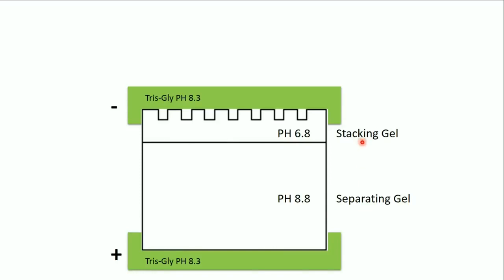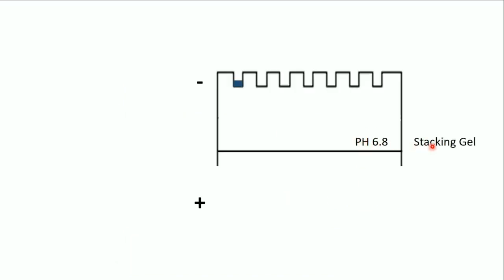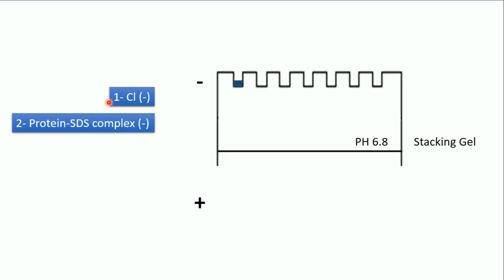So let's first take the stacking gel. In the stacking gel, the pH is 6.8, and here we have the sample. In the sample, we have chloride ions. As I told you, we have the Tris hydrochloride, which gives chloride ions. We have the protein-SDS complex, which is negative. Chloride is also negative. And we have the glycine, which at pH 6.8 is neutral to slightly negative.